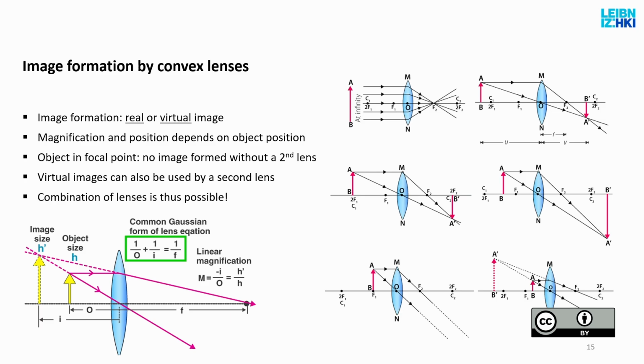And those of you who use microscopes, you will know that the object is very close to the objective lens when we focus a microscope. But this means that with a 60x or 100x or whatever, the image will be formed that many times further from the lens than the object is, somewhere inside the microscope. And if we magnify it further with the second lens, then the image will be moved even further away. And this is where your detector is, for example, a camera on your microscope.